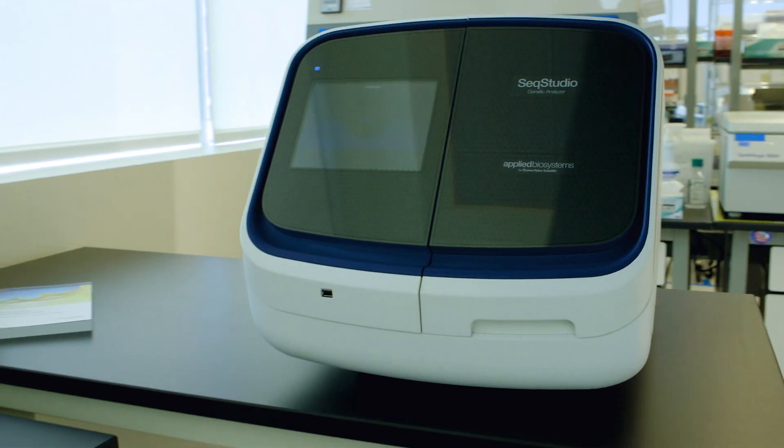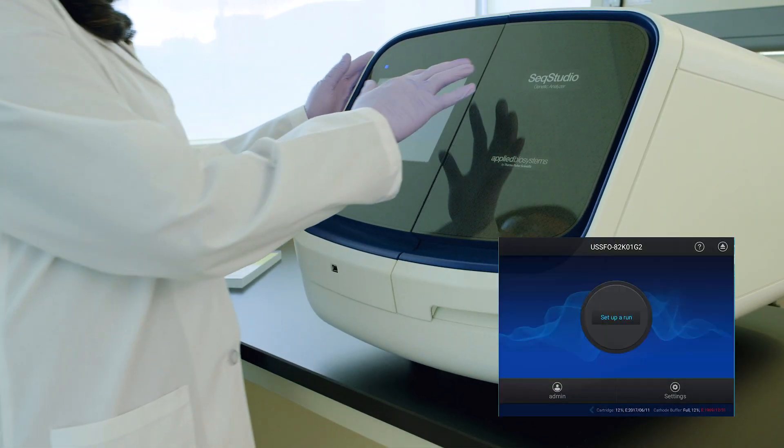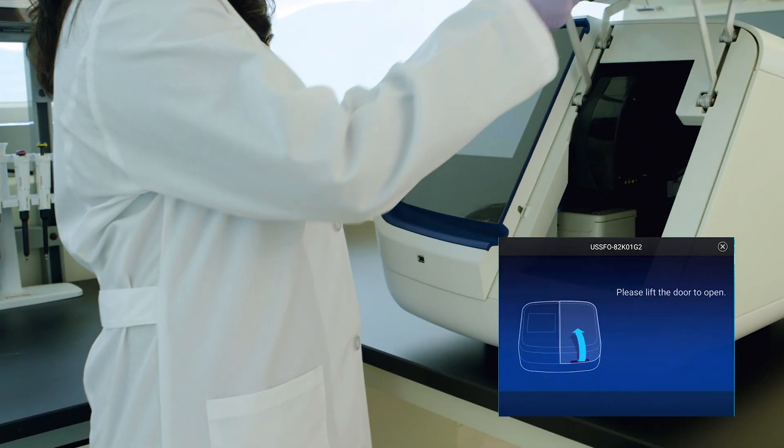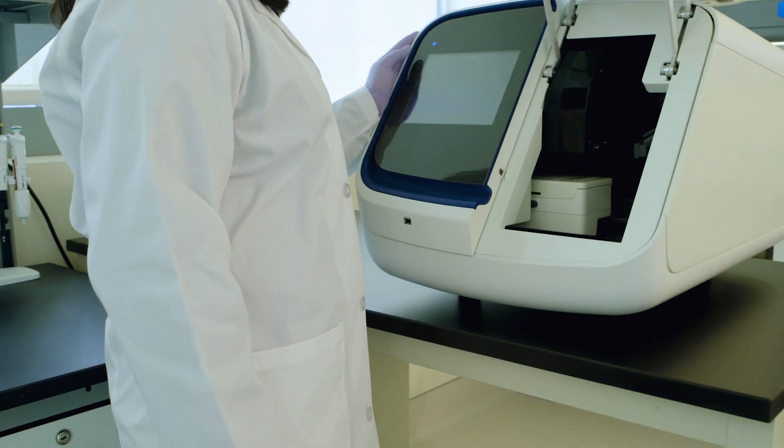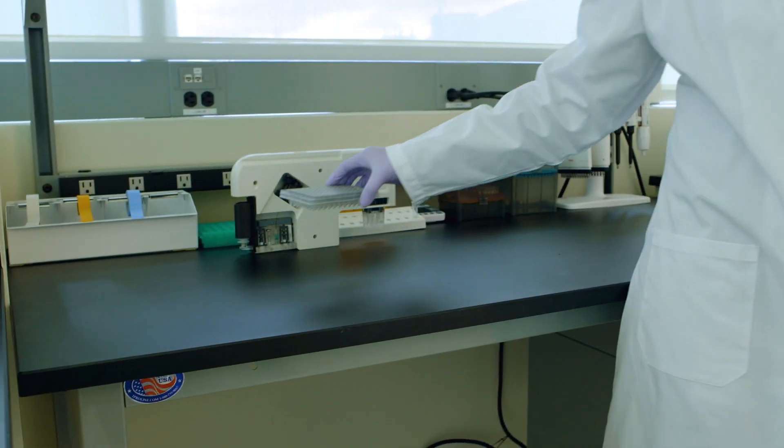This is the new Applied Biosystems SeqStudio genetic analyzer. Open the door. Samples are prepared just like you're used to.